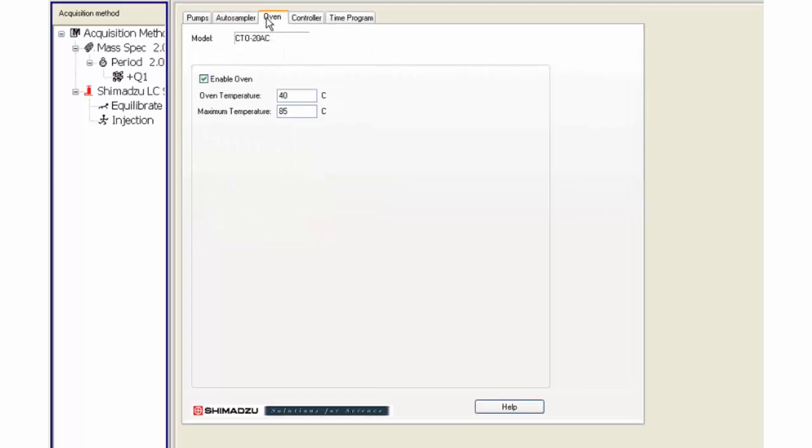Click on the oven tab. Choose an appropriate oven temperature. This needs to be optimized and within the column limit.